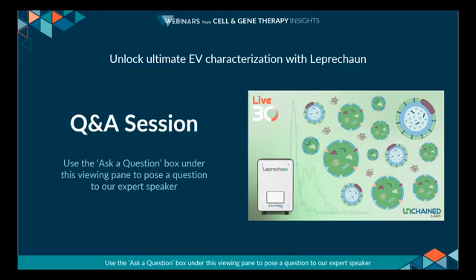Yeah, so on every Luni, we have an isotype control spot. So these are standardly mouse IgG capture antibodies, which complement the isotype of the tetraspanins we're using to capture, or you can customize that if you're using a custom setup. So the software will automatically look at what level of binding you have on that isotype control and subtract that from your positive capture spot. So that is automated.